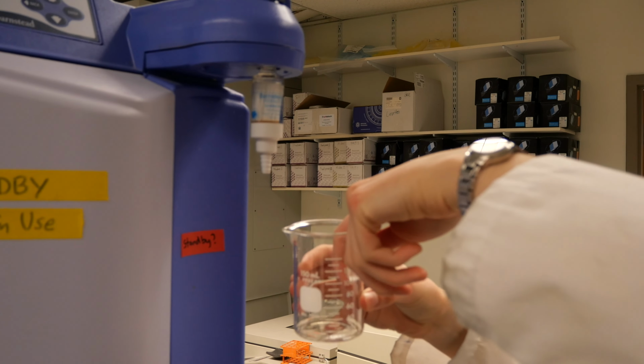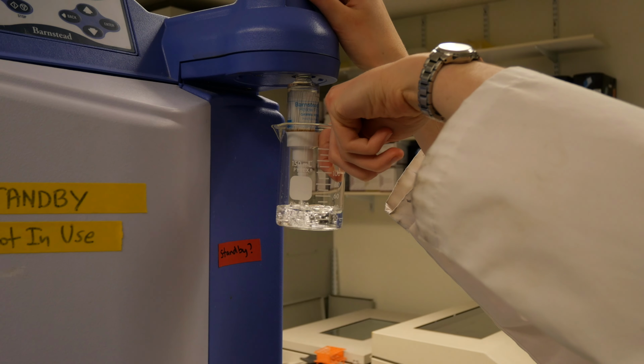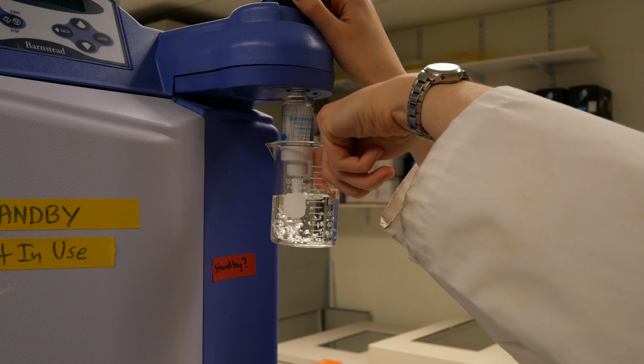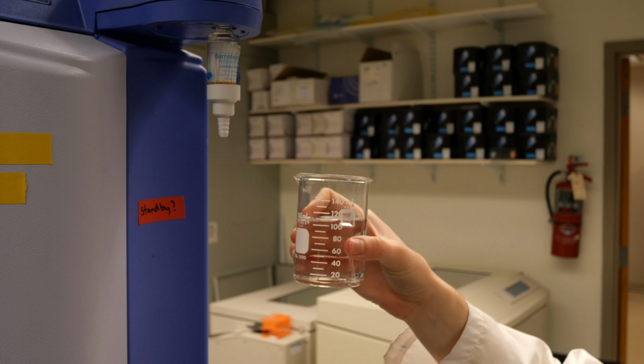At the water filter, she fills up the beaker with water. She can feel when the water level hits her finger as it touches the bump square. Then she can stop it at just the right time.